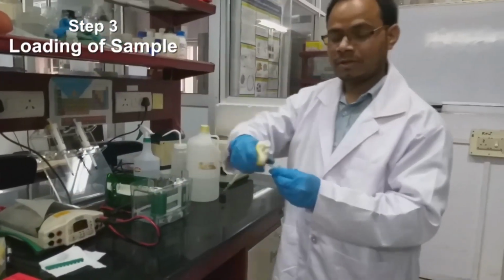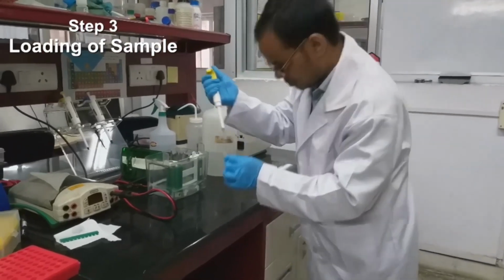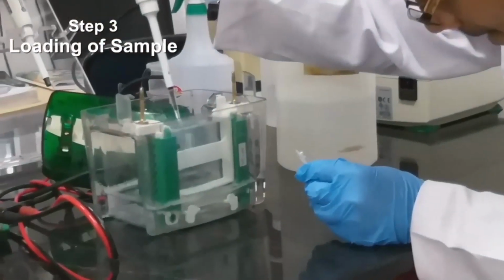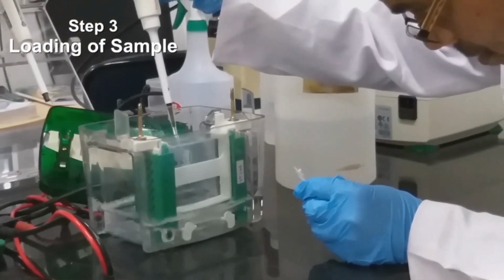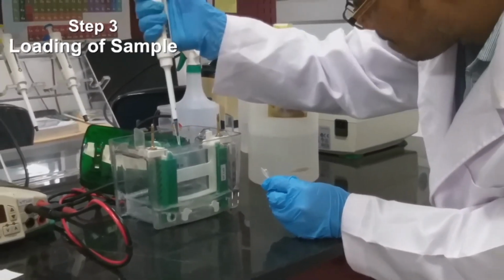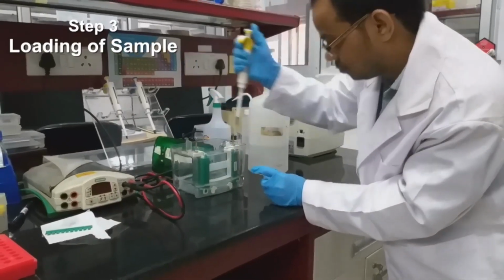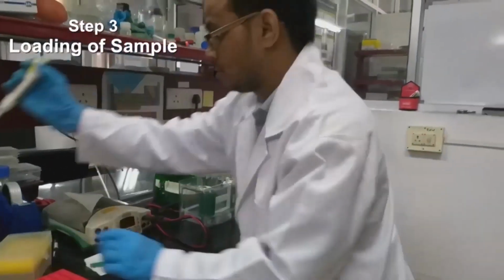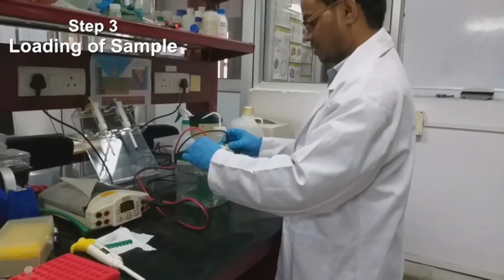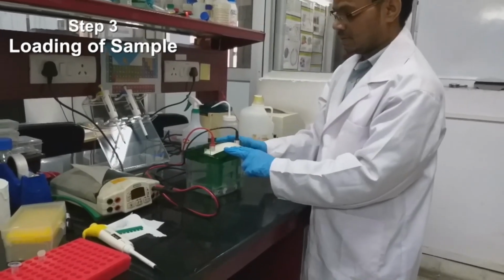Next I will load the sample. Once the loading is over, we have to fix this gasket.